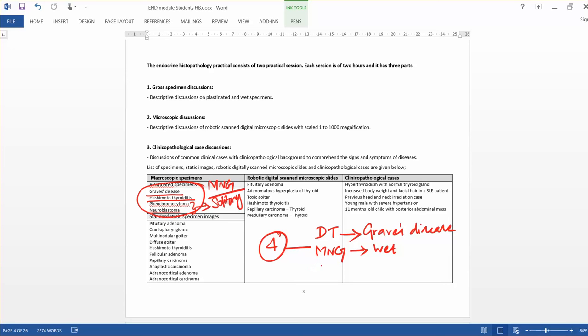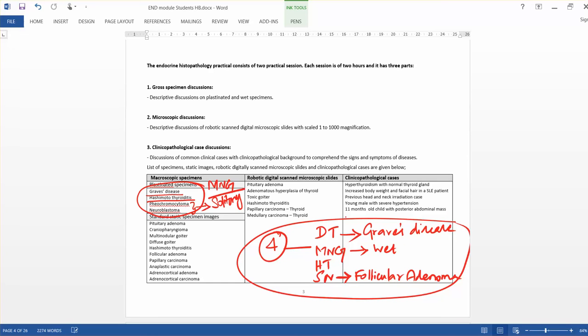The Hashimoto's thyroiditis specimen has a solid, tan appearance. Another specimen is a solid nodule in the thyroid — I showed how it is compressing the normal thyroid area. That is a follicular adenoma, and it is a solitary nodule — follicular adenoma.